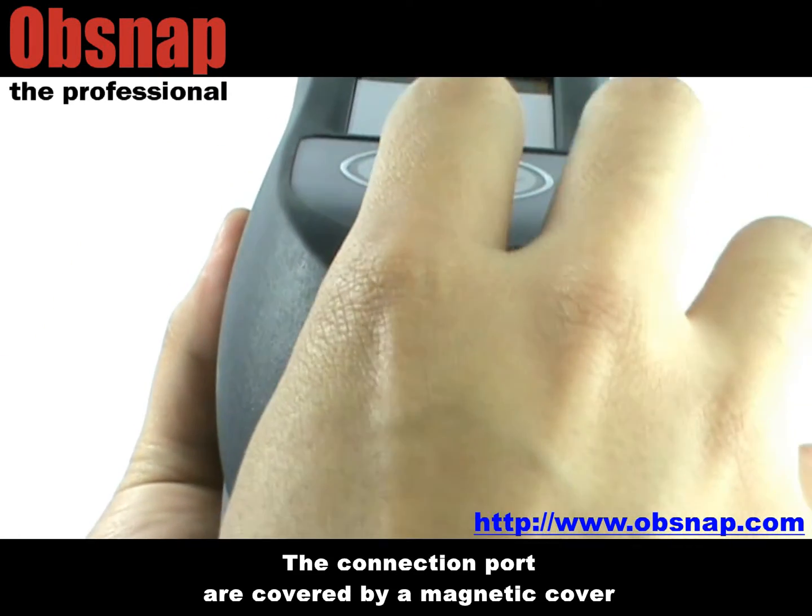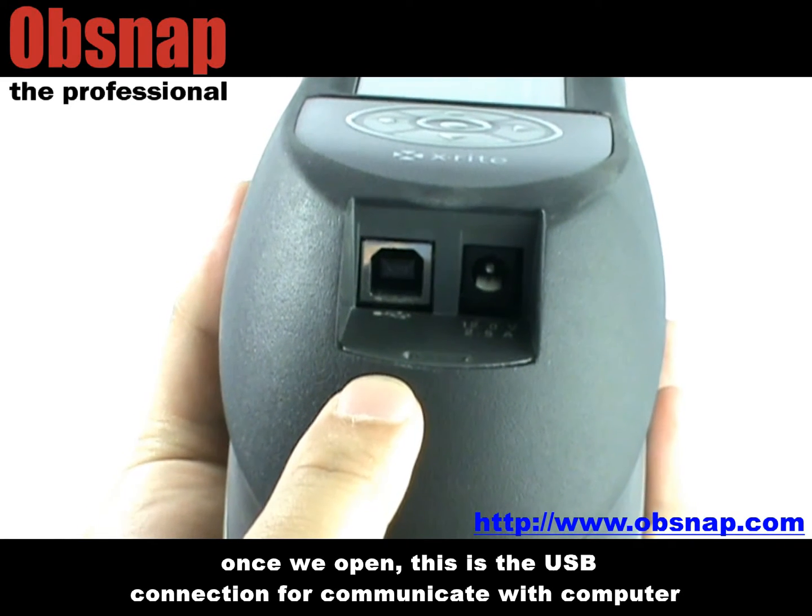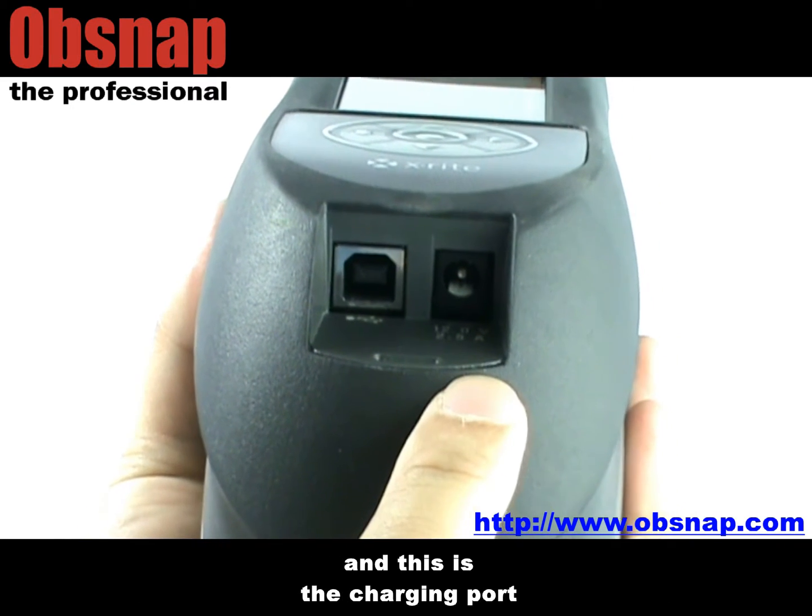The connection ports are covered by a magnetic cover. Once we open it, this is the USB connection for communicating with a computer, and this is the charging port.